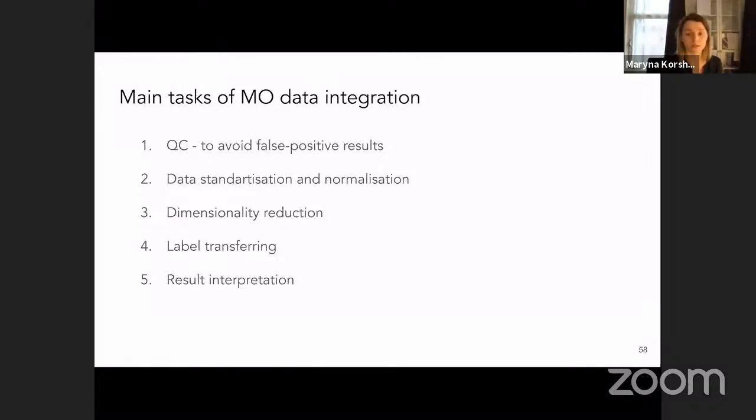And dimensionality reduction. Here is the biggest space for development, because in multi-omics studies, quite a popular and appropriate approach is to do a joint dimensionality reduction. So you have data for your samples in these different modalities, and you try to find, across all of these modalities, the most important and relevant information for your sample. That's how joint dimensionality reduction works.